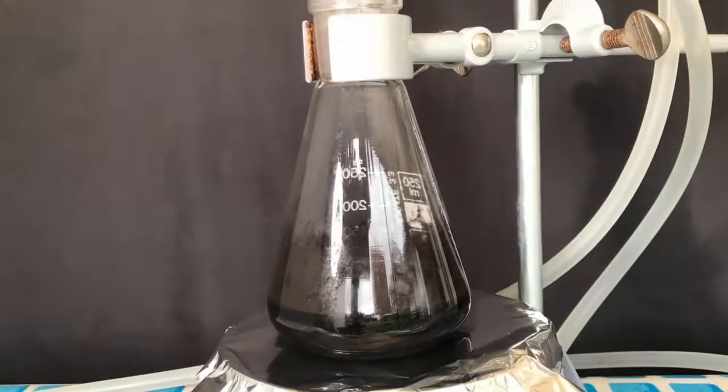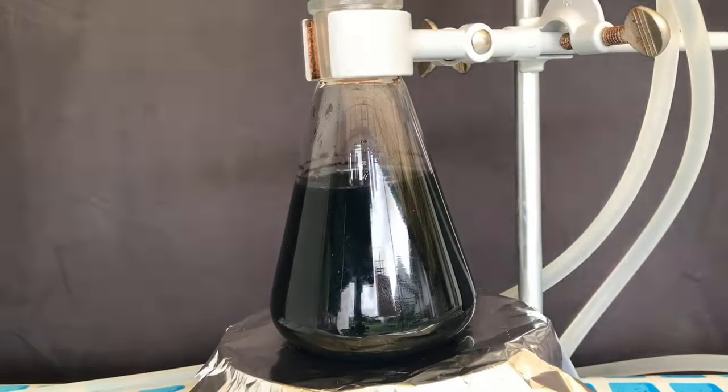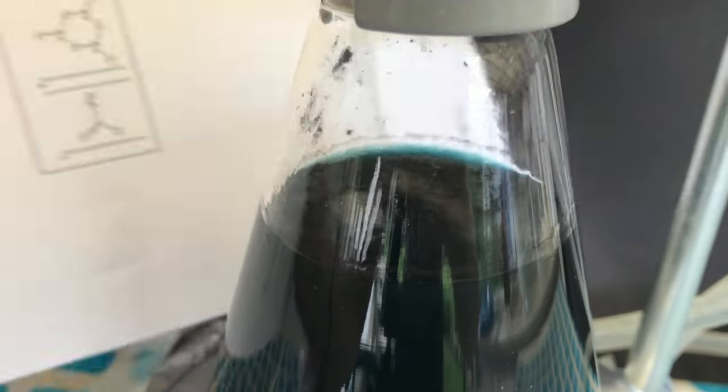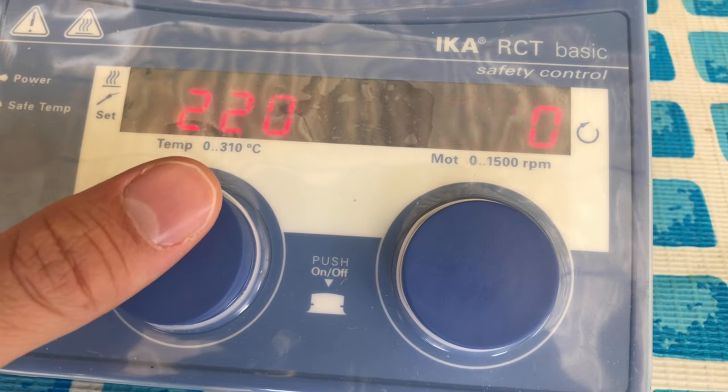We ended up refluxing for 3 hours, adding more distilled water and some more glacial acetic acid, and at the end there was still copper oxide left. If you look closely, the blue color of the copper acetate can still be observed, but we turned off the hot plate and I'm not going to wait any longer.